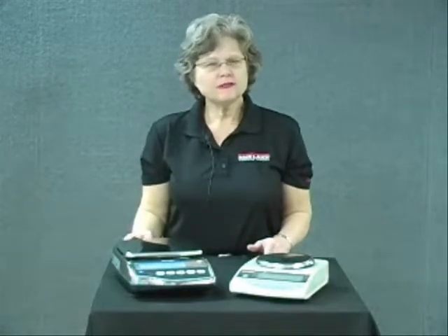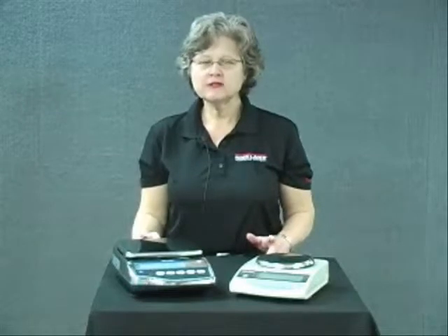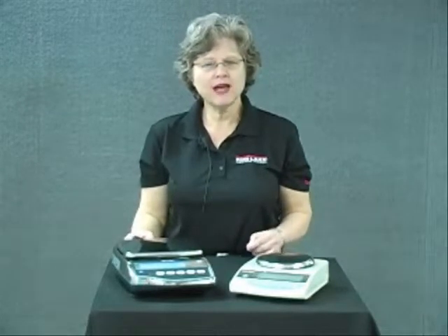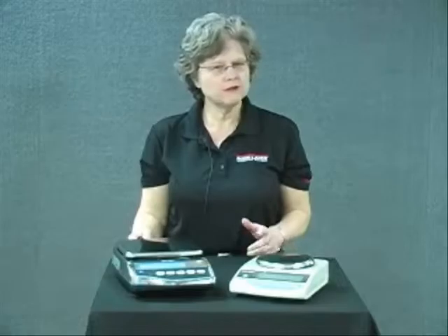A lot of people say they've never heard of tuning fork in balances. Tuning fork technology in balances has been around for many years, and it's also used in other very fine tuned instruments. For instance, a clock — many clocks are based on tuning forks and those have been around forever.